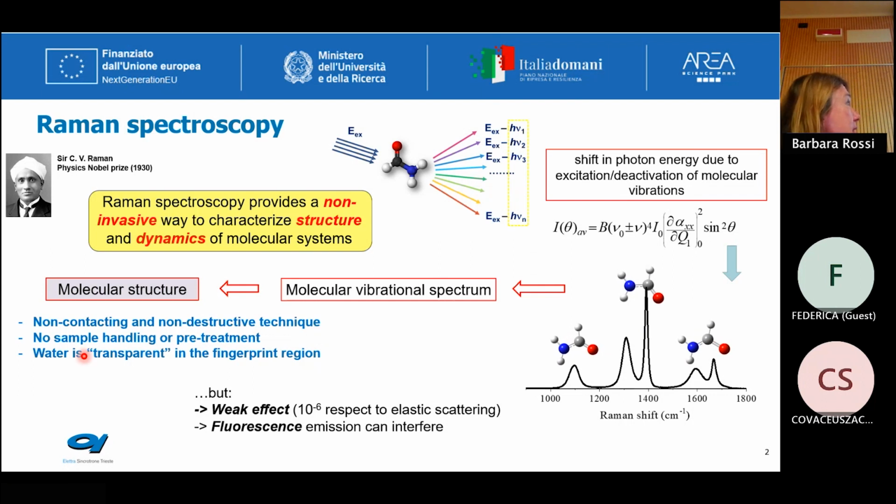The other important thing is that water is practically transparent in the fingerprint region, where we observe the main vibrational bands of biological samples. This means that you can work with your sample in a hydrated state, also in a relatively highly diluted state, without the problem of interference from the solvent.